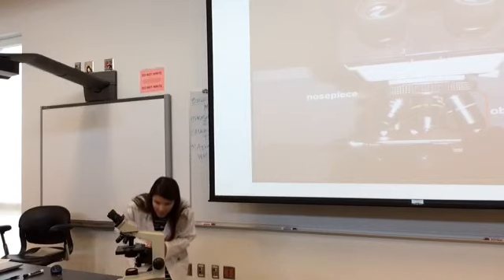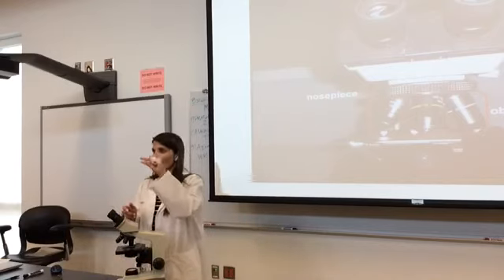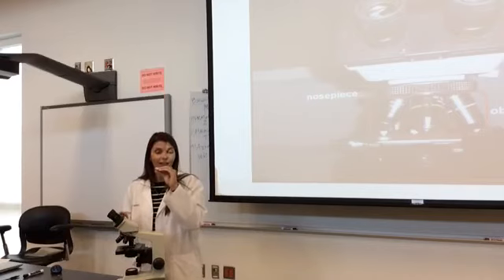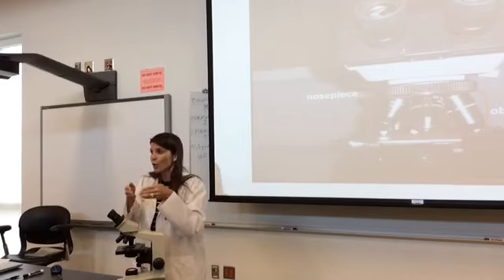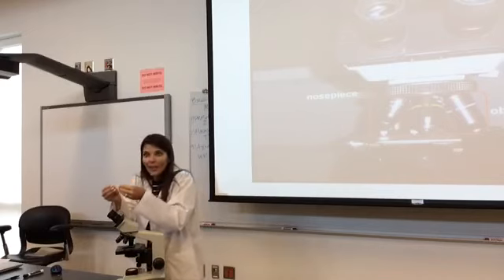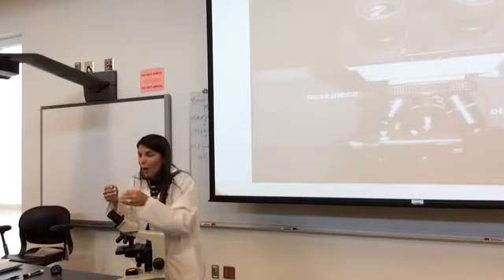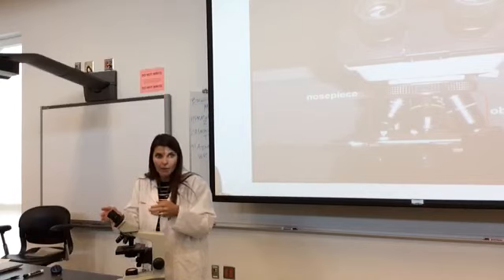Now look at your working distance. Show me on your fingers. Did it get bigger or smaller? Smaller. I got closer to my specimen, so my field of view got smaller, and I'm going to get more magnification. So I got closer, my field of view got smaller, I will get it better magnified.